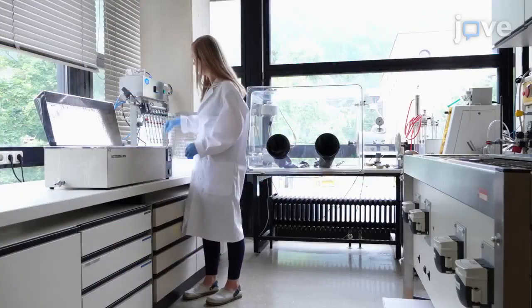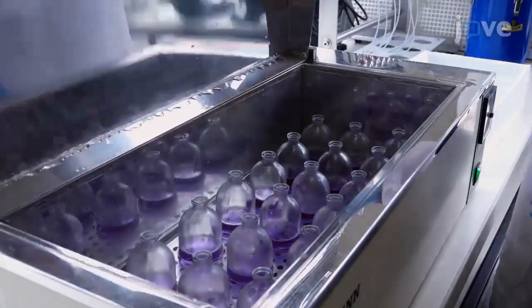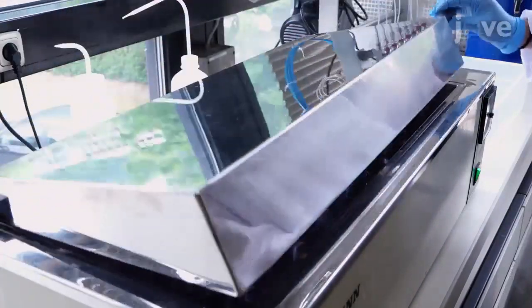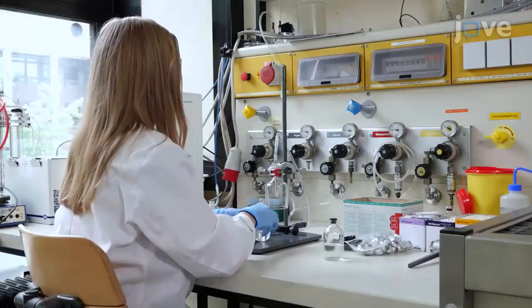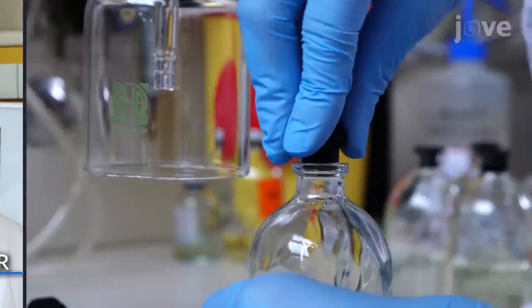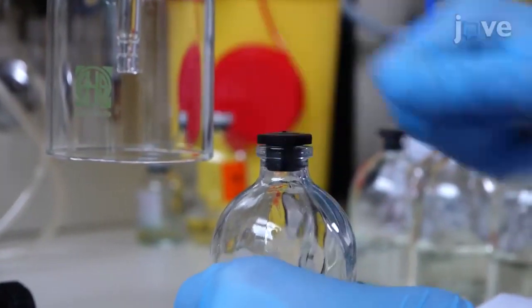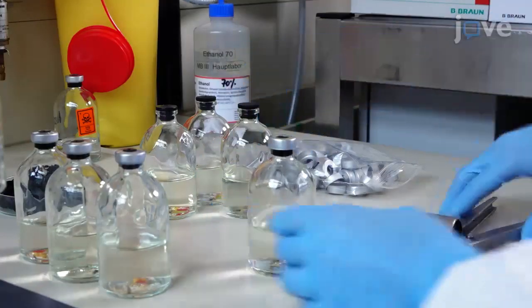then incubate them in a 100 degrees Celsius water bath for 20 to 30 minutes to reduce the solubility of oxygen in the liquid phase. Flush the headspace with nitrogen. Take care of appropriate room ventilation when working with nitrogen. Close the flasks with butyl rubber septa and fix the aluminum caps.